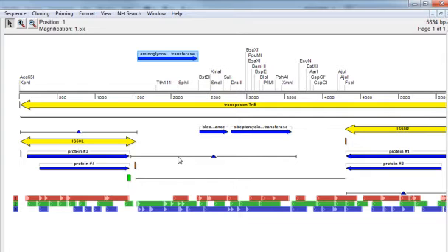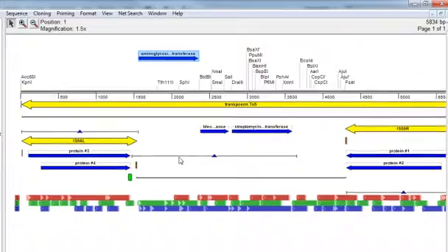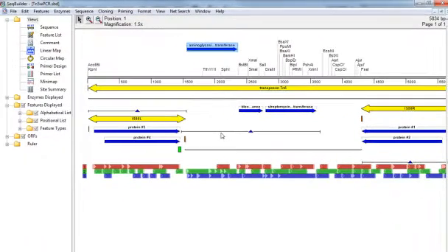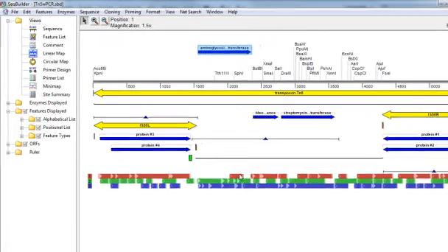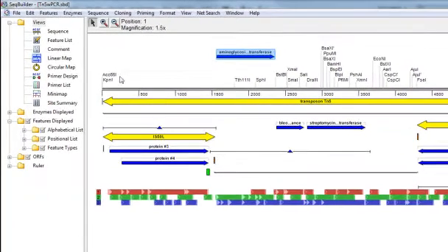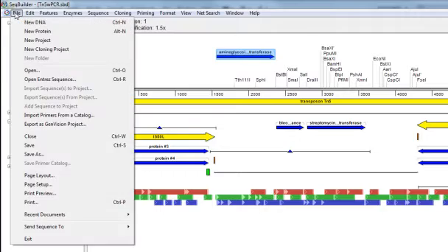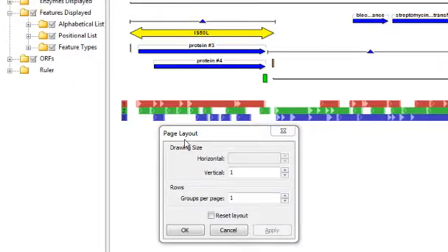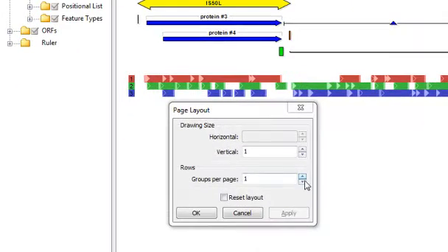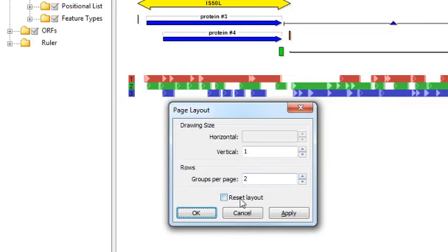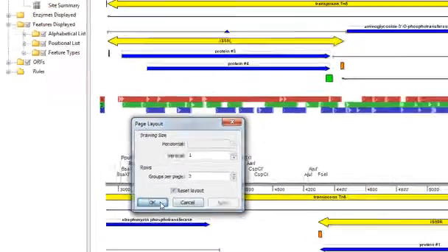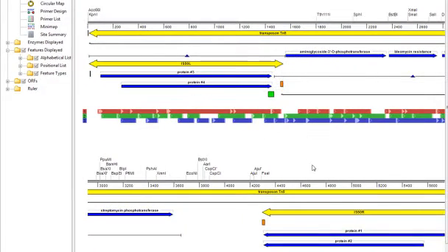If you are going to be printing the linear map, or copying and pasting it into another application, you may also want to change the layout of the map. By default, SeqBuilder tries to fit the map into one standard page without breaking it up. But if you would like to break it into groups, you can just select File, Page Layout, and then increase the number of groups per page. So as you can see now, my linear map is broken up into two separate sections.